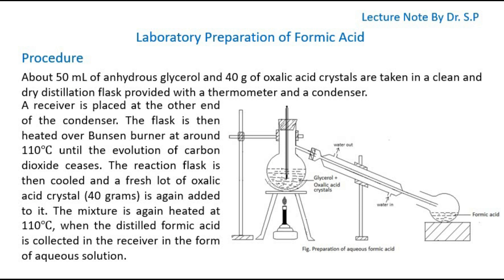A fresh lot of oxalic acid crystals, about 40 grams, is again added to the flask. The mixture is again heated at 110 degrees Celsius, and the distilled formic acid is collected in the receiver in the form of an aqueous solution.